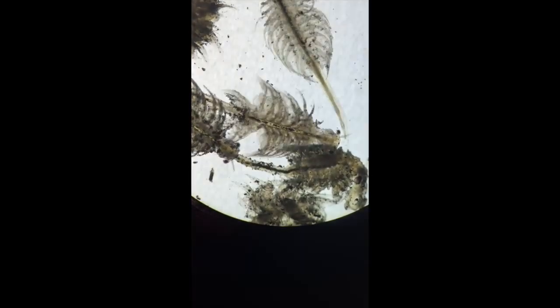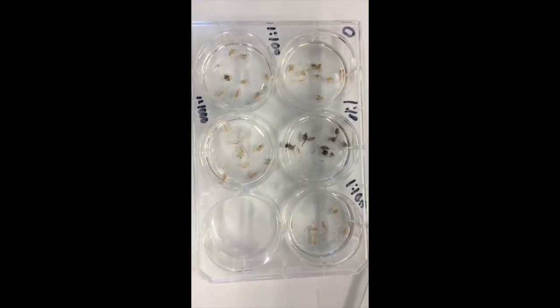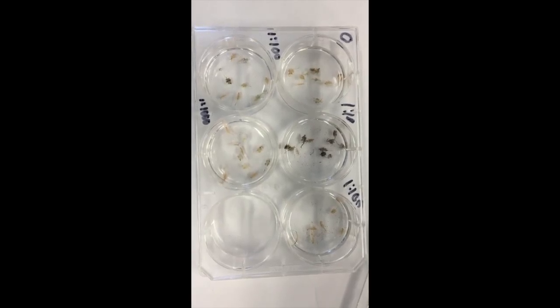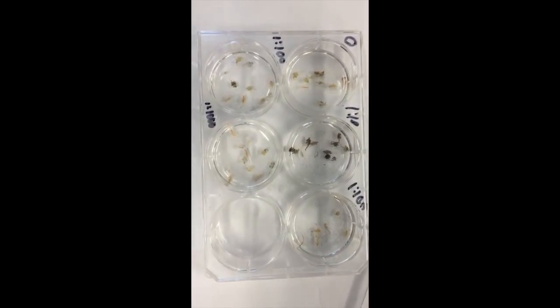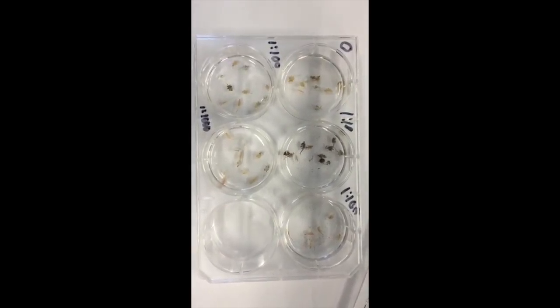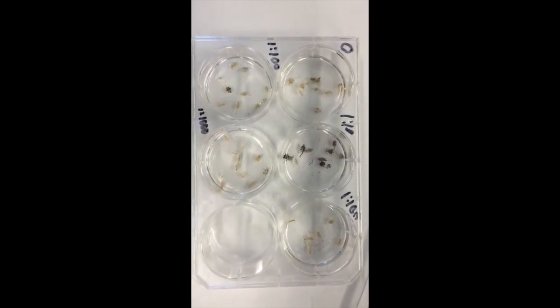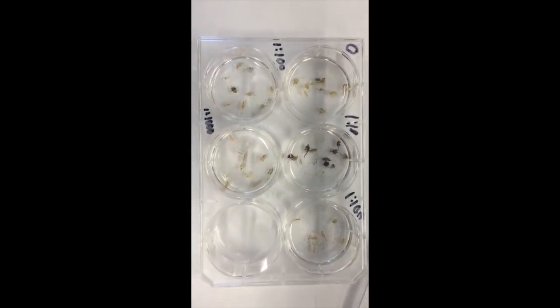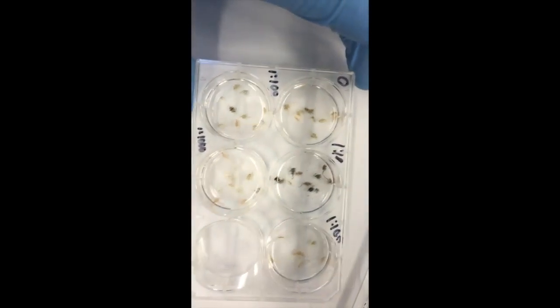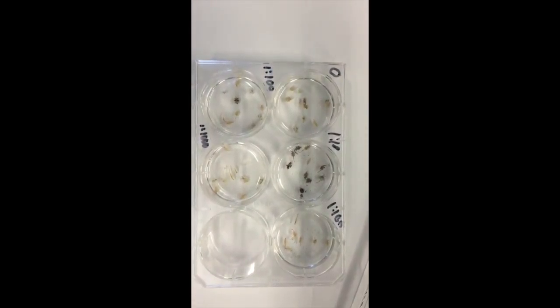of seawater. Day 1 observations concluded that 60% of the shrimp died in the 1 to 1 ratio well, 50% died in the 1 to 10 ratio well, 40% died in the 1 to 100 ratio well, and 40% died in the 1 to 1000 ratio well. Day 2 observations revealed that 90% of the shrimp died in the 1 to 1 ratio well, 70% died in the 1 to 10 ratio well, 80% died in the 1 to 100 ratio well, and 70% died in the 1 to 1000 ratio well.